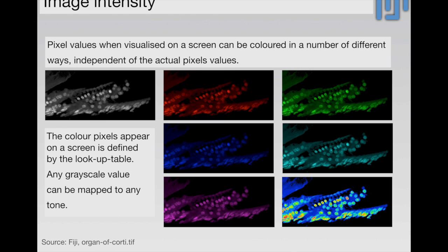So sometimes you can save fluorescence that's been caught within a certain range due to the filters, and the detector just counts the photons. Then the software will store in the image file what filter was there, so what range those pixels were from, and it will assign it an arbitrary color. But that color can be changed very easily. You just choose a different lookup table.